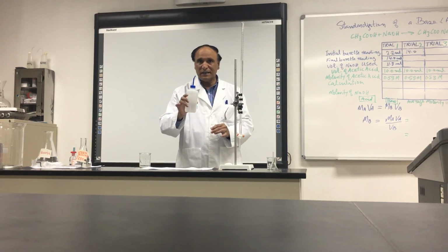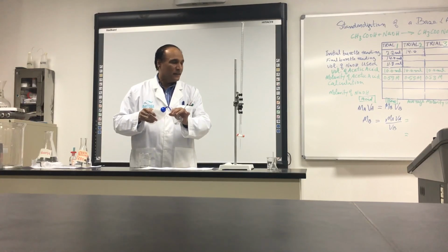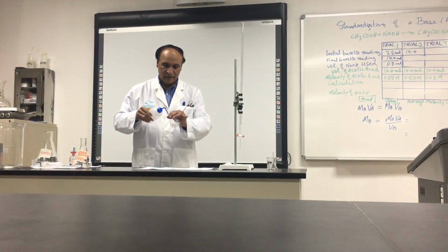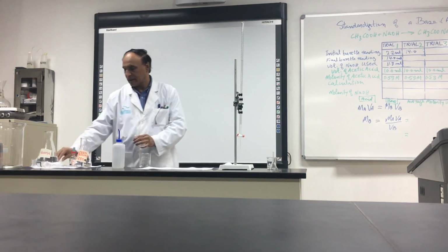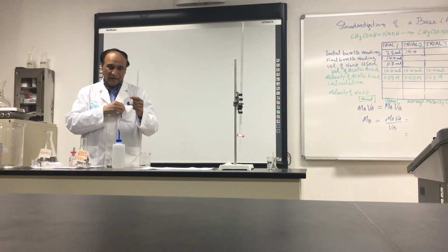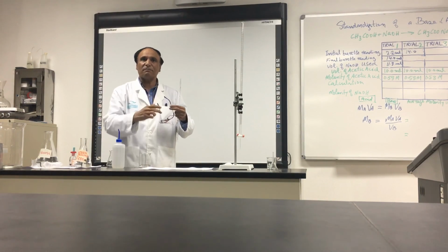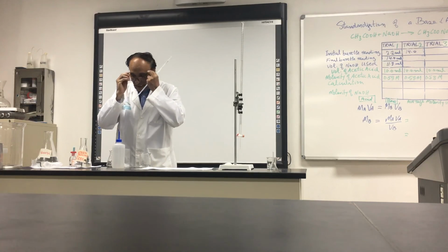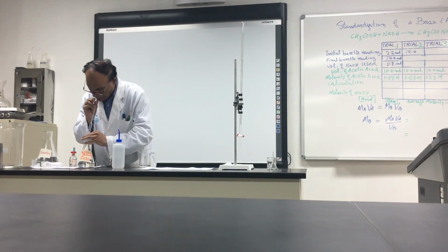The second student will wash it. No need to wash this one because it is already washed. So now the students will exchange their program. The second student is doing it. Take it 10 milli.